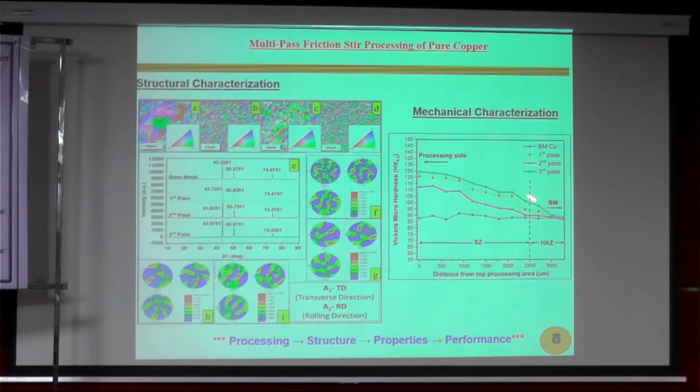That means by doing friction stir processing, the grains are getting disoriented and we are getting very strain-free, finer grains. The finer grains give higher hardness according to the famous relation called the Hall-Petch relation. So we can relate it that way. You can see here, friction stir processing decides the microstructure, microstructure decides the properties, and properties decide the performance. It matches well with our new characterization now.